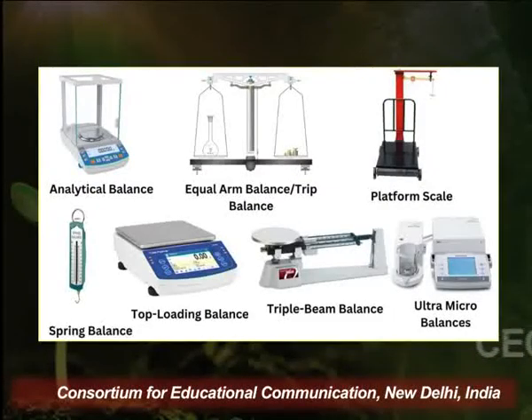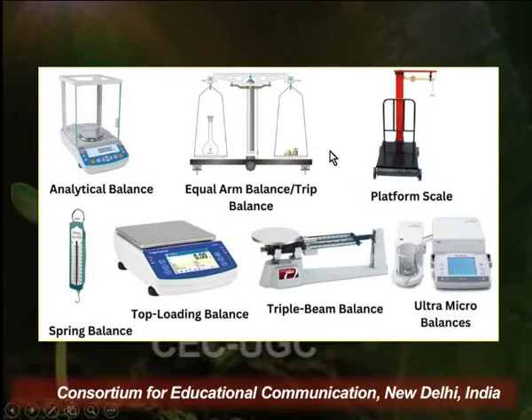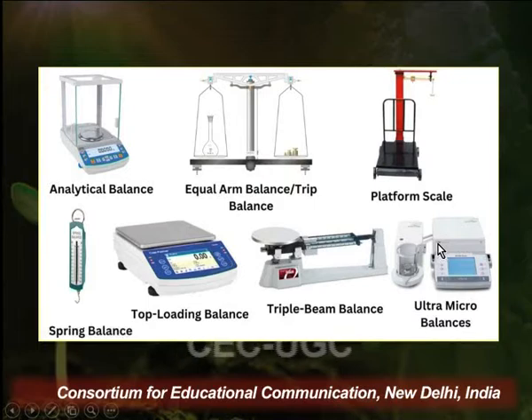This one is an analytical balance, and this one is an equal arm balance, also called a trip balance. This is a platform scale used for heavy mass weighing. This is a spring balance, a top loading balance, a triple beam balance, and an ultra micro balance, which is used for very minute and very precise weighing of any substance.